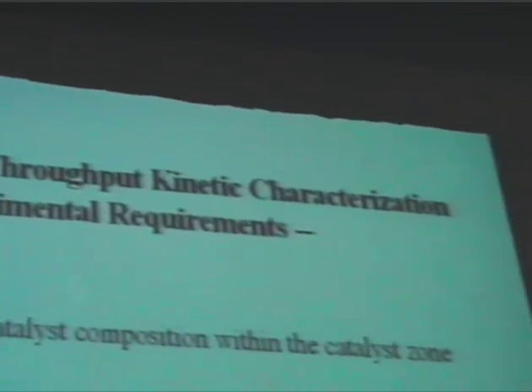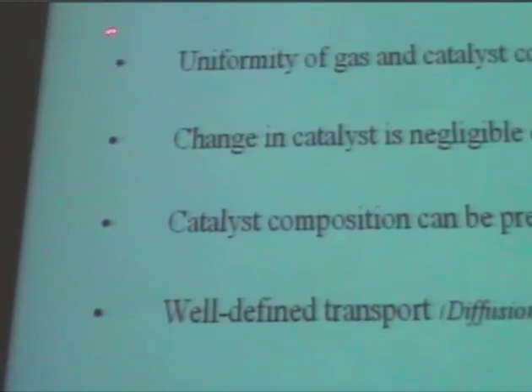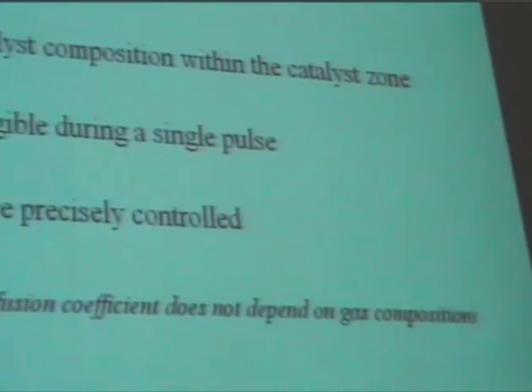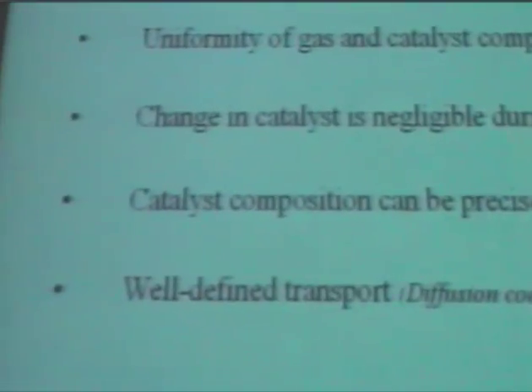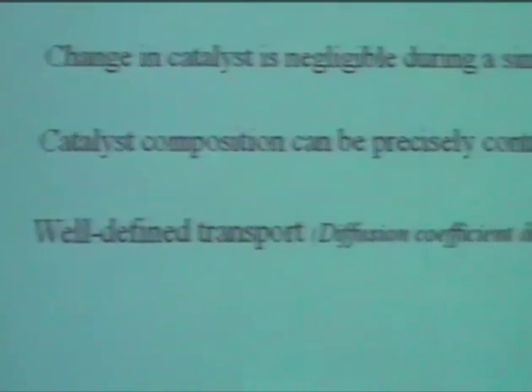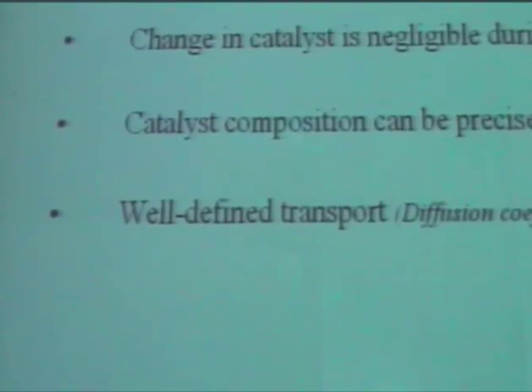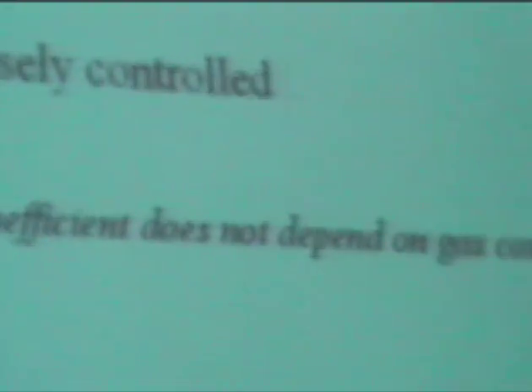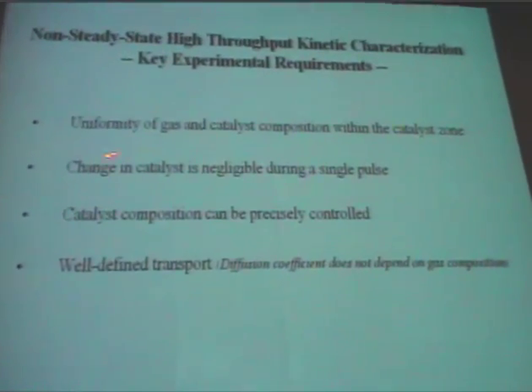Okay. So this device, which is used in more than 15 groups in the world, is based on non-steady-state, high-throughput kinetic characterization. When we talk now about combinatorial catalysis, we are talking mostly, 99%, about steady-state analysis. But in difference from that, temporal analysis of products is non-steady-state, high-throughput kinetic characterization.